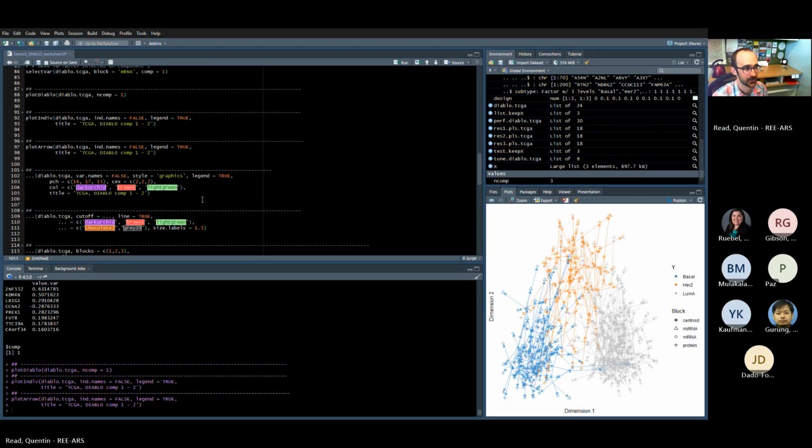Yes, Bharat. I have one more question. I'm assuming that each point is coming from each sample, right? Yes, there should be 150 points on here. Well, there's 150 times 4 points on there, 1 for the center and 1 for each of the 3 omics. Each sample has like a Y-shape, because in this particular data set we have 3 omics. So each sample is being classified overall and separately by each of the 3 omics. So there's 4 points for each sample there.